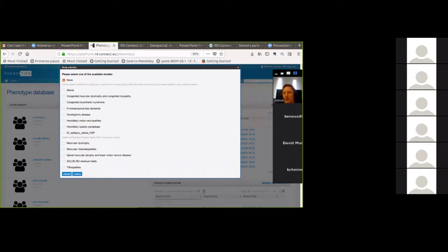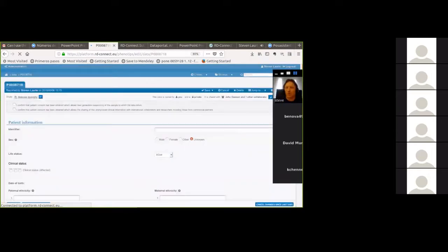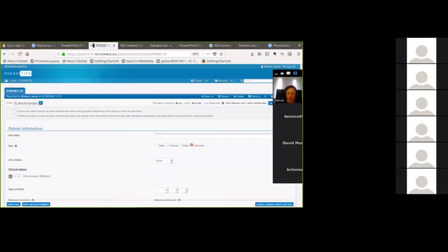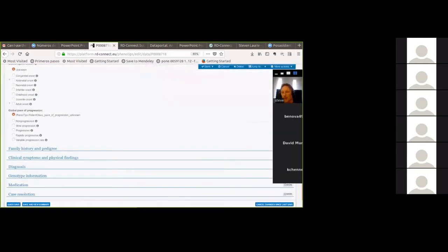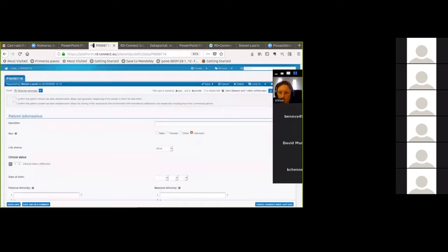This webinar is aimed particularly at the neuromuscular disease European research network, although other people here will find it equally relevant. If we select the muscular dystrophy template, what opens is an abbreviated form of all the possible entries and data you could enter into PhenoTips. This was designed for some of our research just to make life easier. The first thing we need to do is put in an identifier for our case — whatever you use as your local identifier.